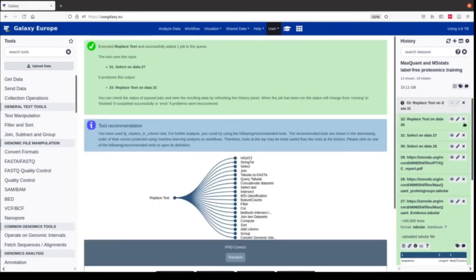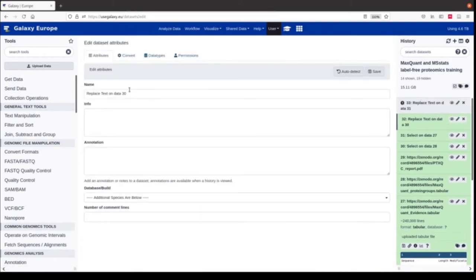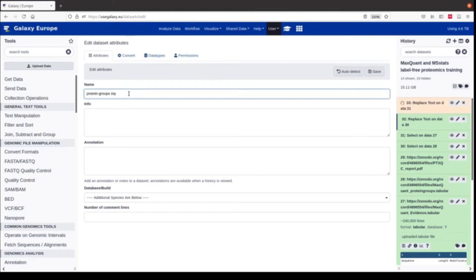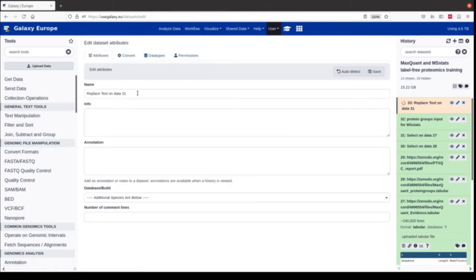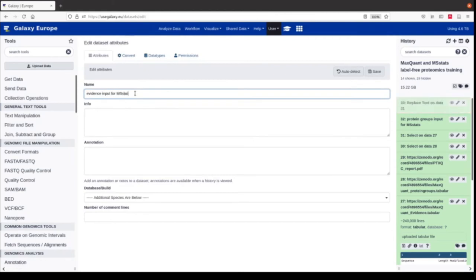To keep track, we rename the files. The first file was the protein groups — we name it 'protein groups input for MSStats'. In this file we have all protein groups and they should only be human proteins, but they should not be labeled anymore as potential contaminants because then MSStats would remove them. The protein groups in MSStats are only needed for protein inference; their quantities or abundances will be ignored by MSStats. We also rename the other file to 'evidence input for MSStats'.